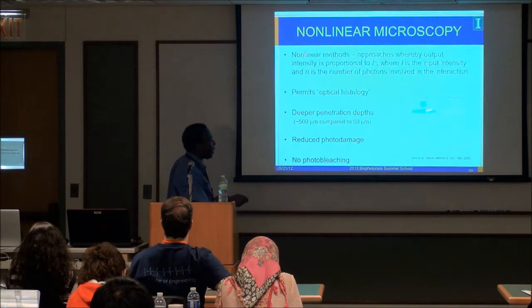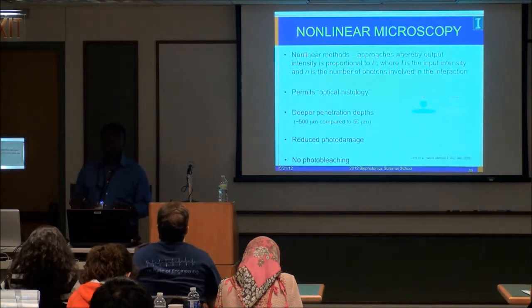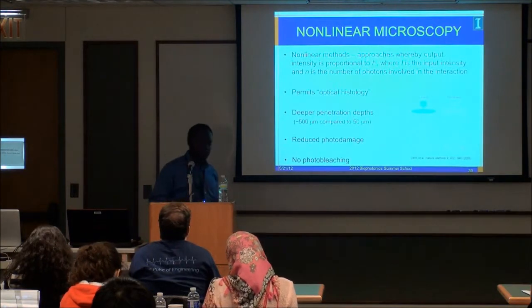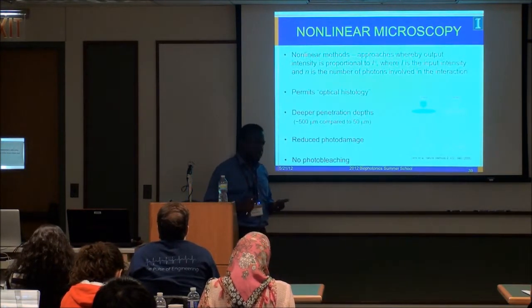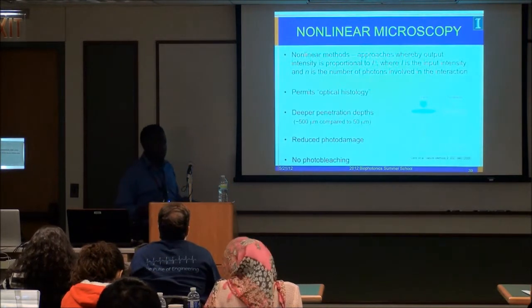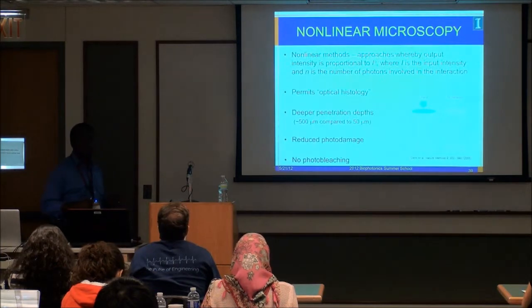So here we have our hourglass pictures, linear and nonlinear. With that technique? No, you can still get good resolution. It's a more complex system, but the resolution is, as far as I know, not altered at all. As a matter of fact, that's one of the things we're looking into in my lab.